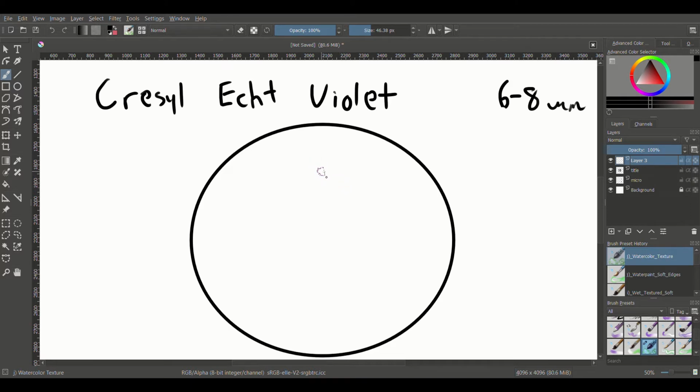Because the Nissl substance is going to show up fairly dark just because of how thick it is compared to the nuclei, we're going to use a way of decolorizing this. So it's sort of a regressive stain in that way. Procedurally, we are going to stain everything with Cresyl Violet, and that's going to be pretty close to hematoxylin purple, really. So yeah, something like that.